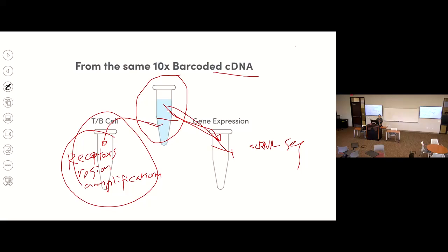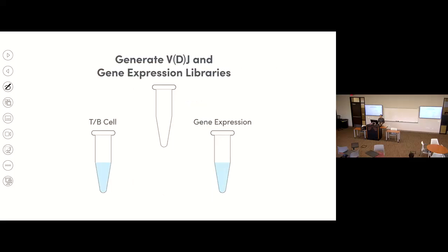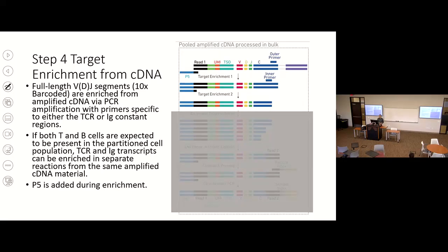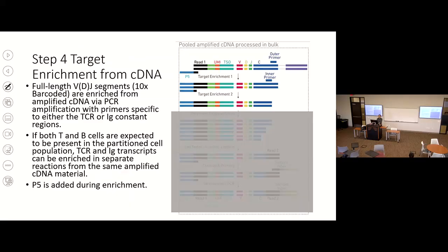But now this library will be put half into the T cell receptor amplification. On this side, there is a new pair of PCR primers.